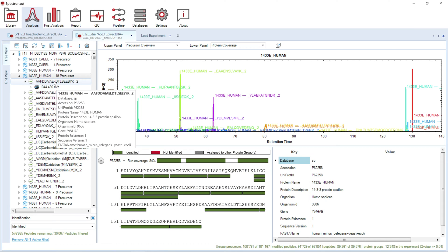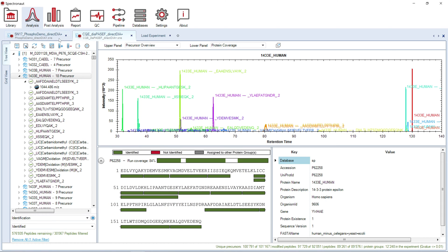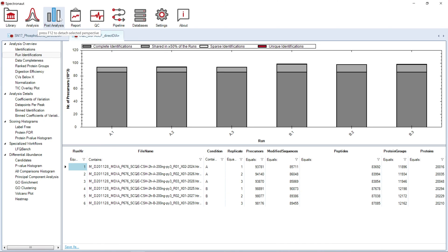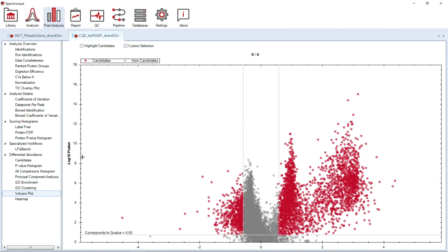The post-analysis perspective will give you an overview of the results on the experimental level, that also allows you to explore results of differential abundance analysis.